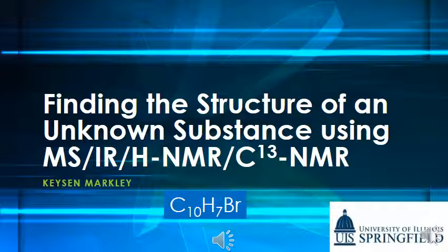We'll be finding the structure of an unknown substance using mass spectroscopy, infrared spectroscopy, proton NMR, and carbon-13 NMR. Now the structure we'll be using today is C10H7Br.